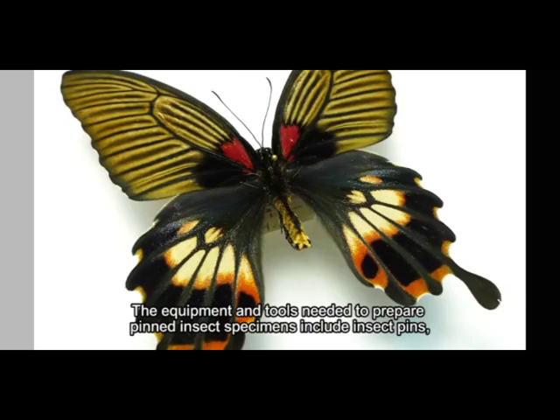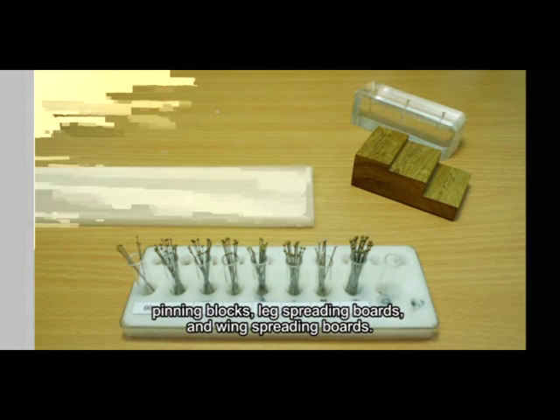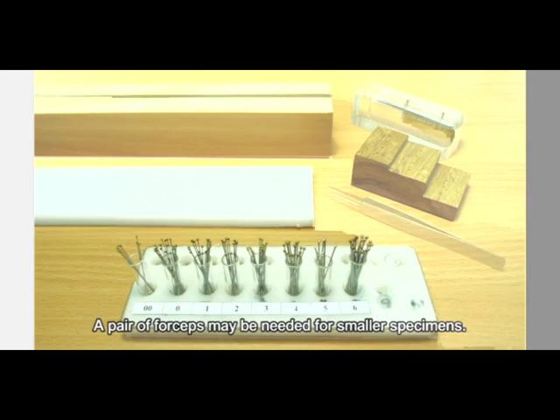The equipment and tools needed to prepare pinned insect specimens include insect pins, pinning blocks, leg spreading boards, and wing spreading boards. A pair of forceps may be needed for smaller specimens.